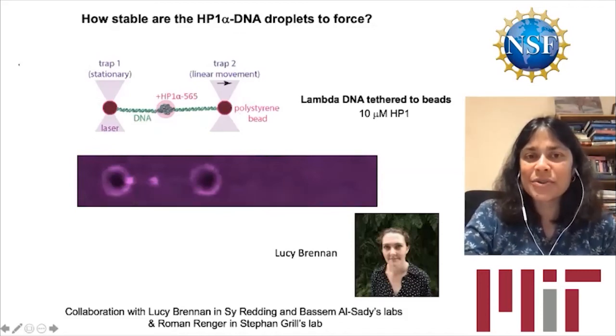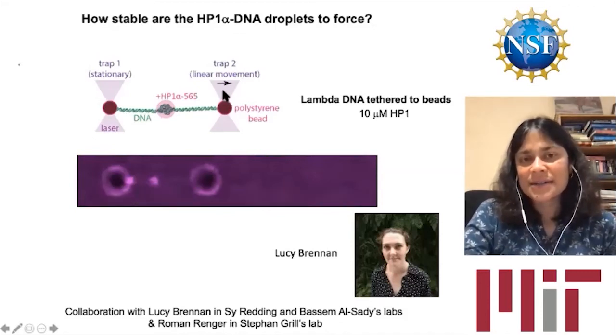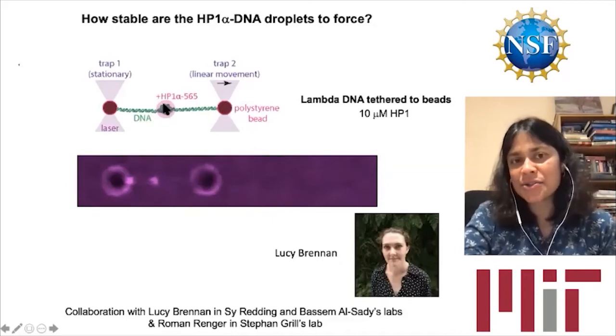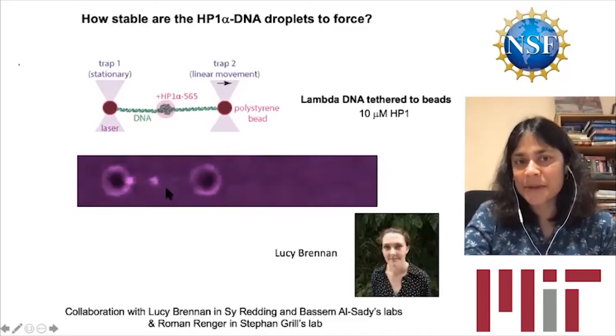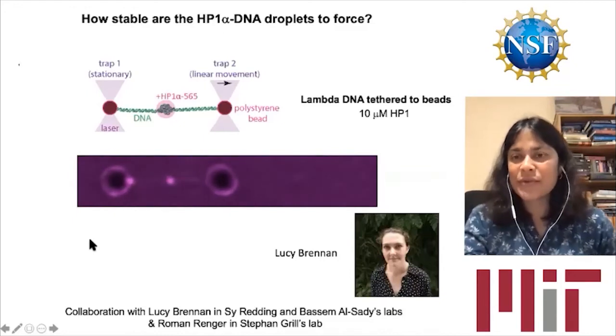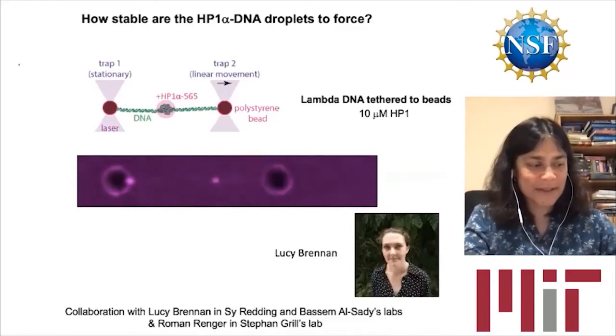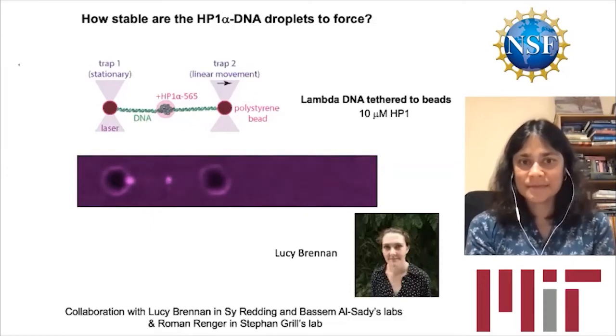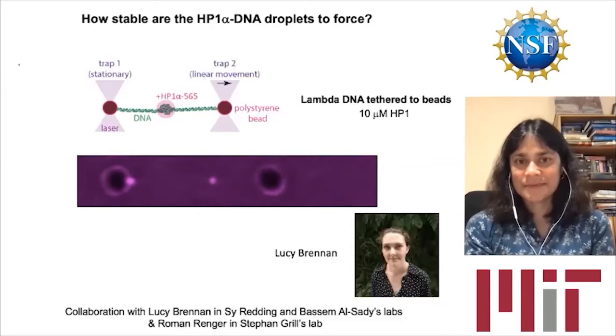And now they ask, what happens when we pull this polystyrene bead in the optical trap? How much force do we need to dissolve this droplet? And this is what they see. What I'm showing you is the first few pulls of 10 successive pulling experiments. They're pulling. It's not coming apart. It's not dissolving.